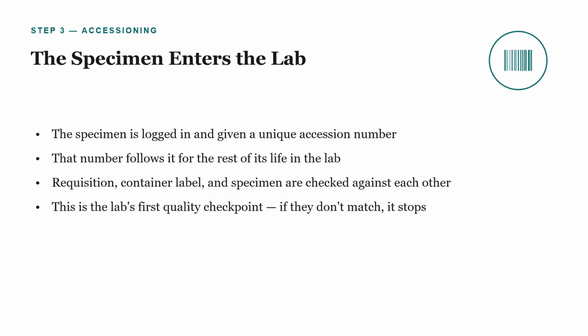When the specimen reaches the lab, it's accessioned, which means logged in and assigned a unique accession number that will follow it for the rest of its life in the laboratory. Every block, every slide, every report will carry that number forward.